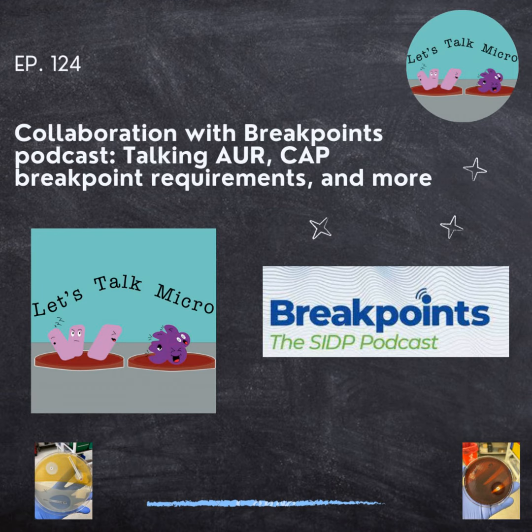Yeah, if you see 2+ GPC, let's say, on the gram stain, and it's swarming Proteus, you're going to have to start bringing other media. So evaluate your plate. If you see that swarming creeping in, isolate whatever you can right away, because it's going to take over and be harder to get it out. That's why I said you can tell who the micro people are: I said swarming Proteus, and that's every technician's nightmare.